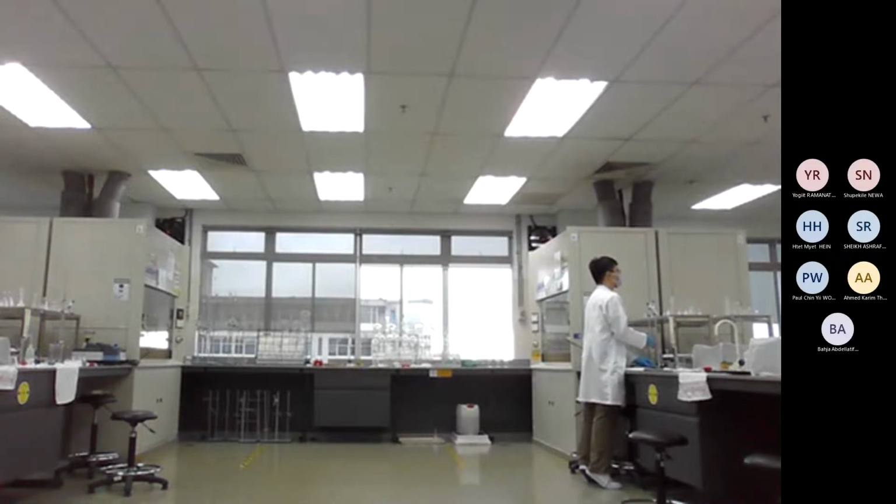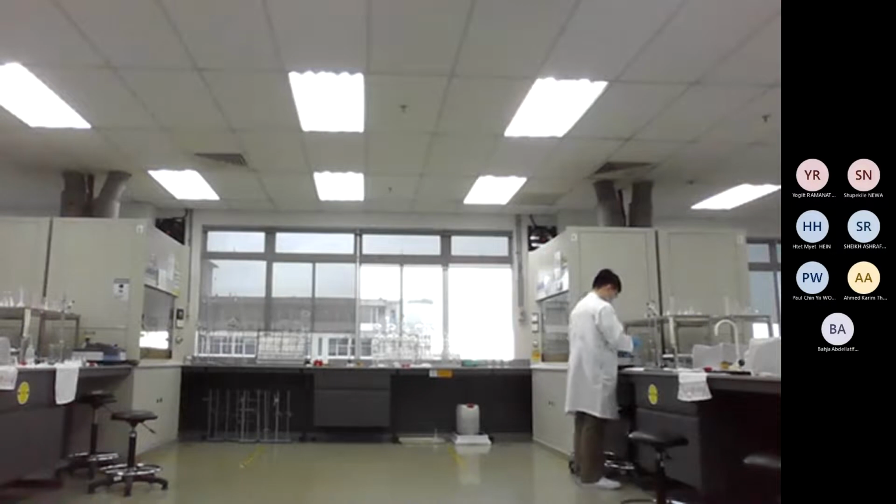For this, it's the same. This is also the same, right? Yeah, for this one, but only the volume is different. So mix together. Yes, just mix together. Yeah. For this one, this is the same, right?